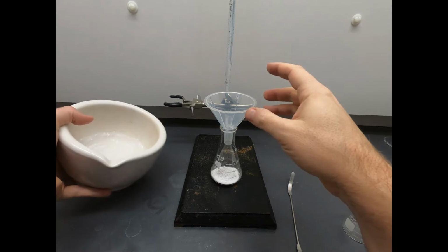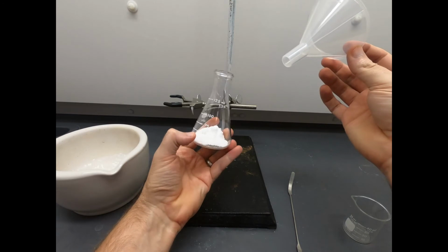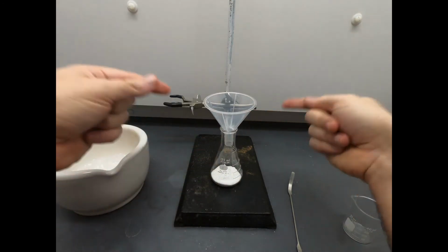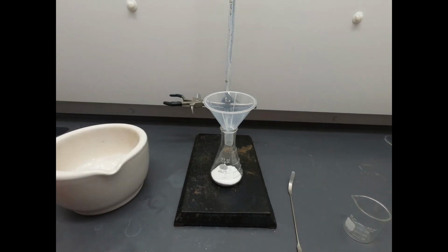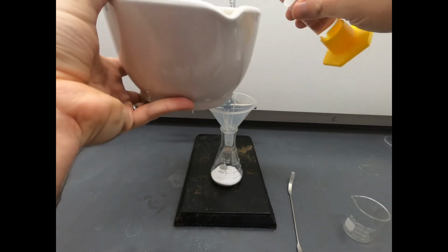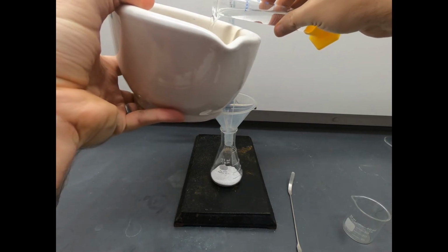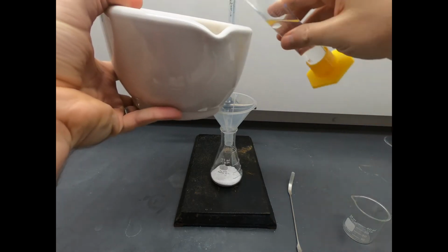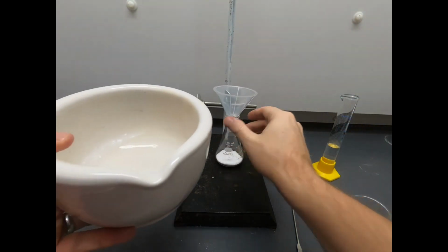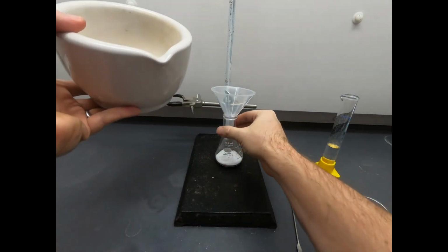So what we're going to do is extract this powder with isopropanol. Instead of just dumping isopropanol into the flask, we'll use some of this isopropanol to rinse out our mortar. This is about 50 milliliters. This is what the procedure calls for. Let's pour just a little bit of this in here. I'll do a little more than that. It's maybe 20 or 20. Whoa, that would have been a disaster. 20 or 25 milliliters.